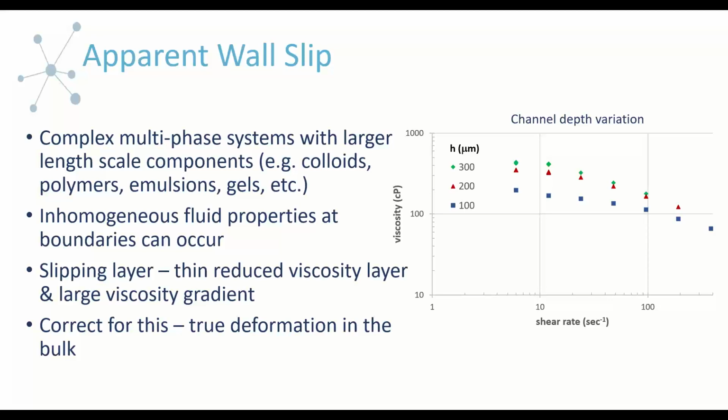It looks smooth to us, but in reality there is some roughness associated with it. It's very easy for these tiny molecules like water or an alcohol to get stuck in the asperities on the surface of the boundary.